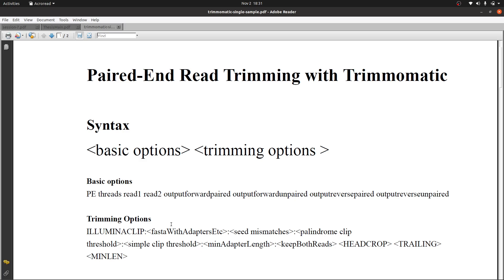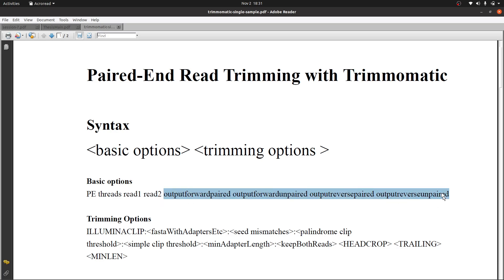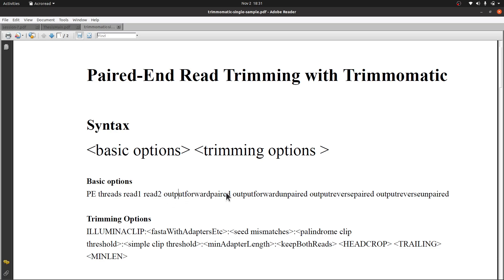You can also specify your own values if you want. On the command line you specify whether it's paired-end or single-end, and the number of threads — there's a default value but you can specify your own. For input you have to specify the R1 and R2 files. You also have four output files: output forward paired, output forward unpaired, output reverse paired, and output reverse unpaired.